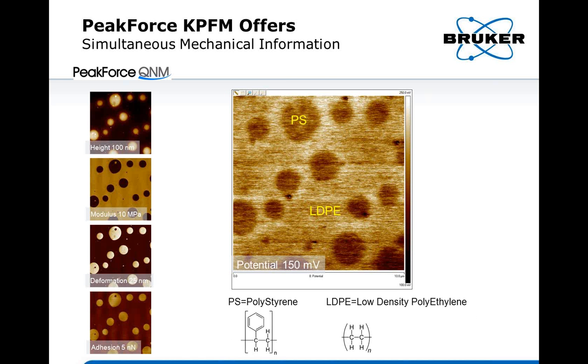So now, let me switch to a different sample. That is a blend of polystyrene and low-density polyethylene. So first, let's take a look at this one. Here, I want to show you that the combination of PeakForce KPFM with PeakForce Tapping mode affords us the capability PeakForce Tapping mode has. It has this quantitative nanomechanical property mapping capability.